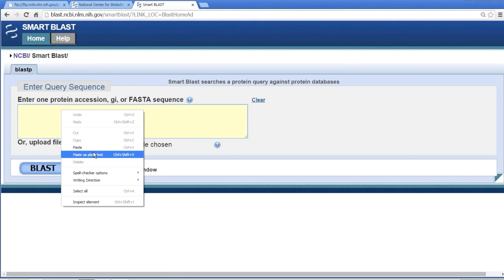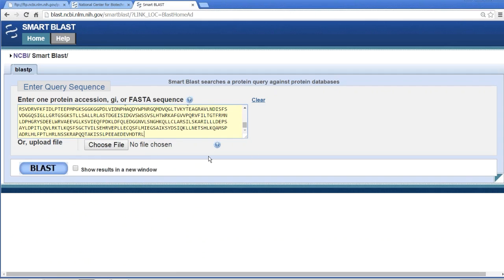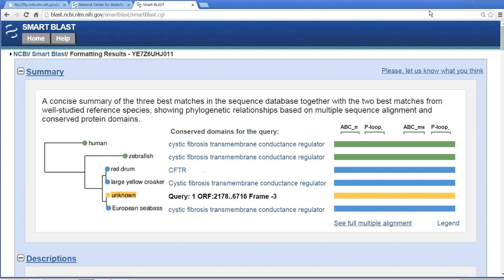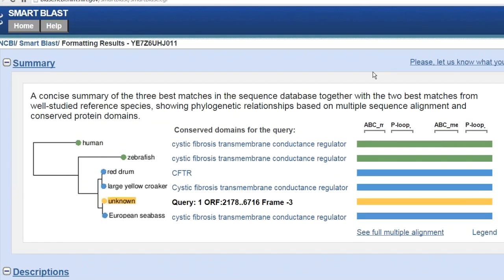I can just put my protein sequence in there. One of the real beauty parts of this is how quickly it happens — this is practically instantaneous. Right away I've got a result that tells me pretty much what I need to know. Looking at my graphical view, I've basically got the whole thing. It happens to be a protein I would expect to find in any vertebrate genome — this is a cystic fibrosis transmembrane conductance regulator. I can grab the name from the zebrafish or human protein shown there.